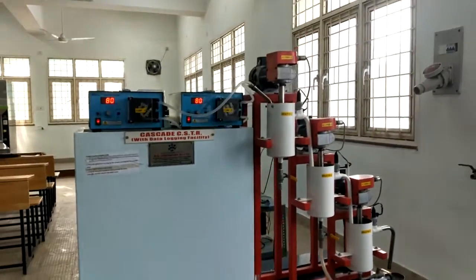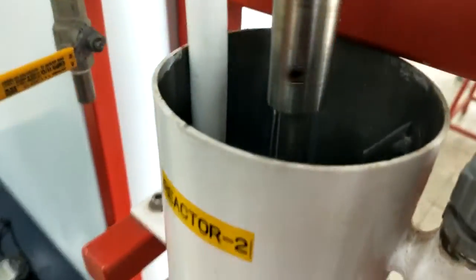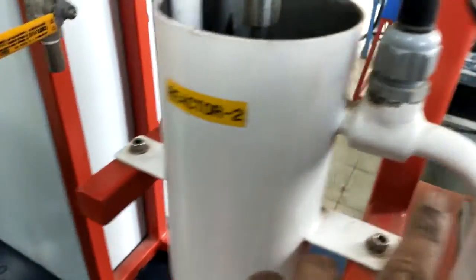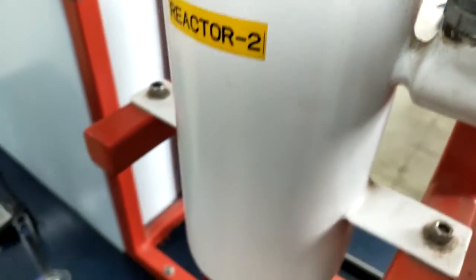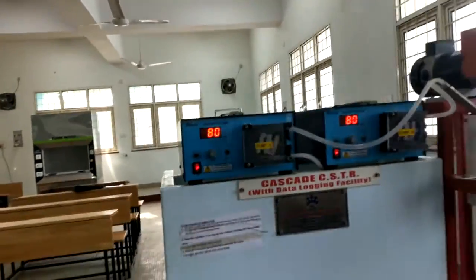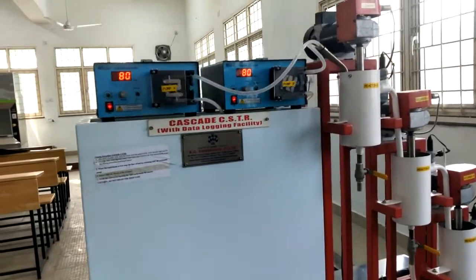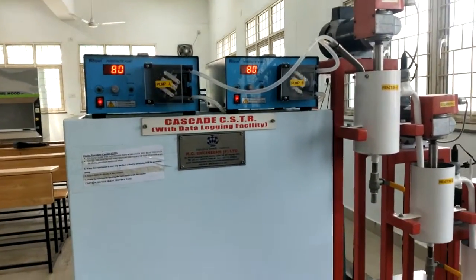Okay, we can see the first reactor has filled and the second reactor is half filled. So once it is filled up to this level, we are going to have feed to the third reactor. Okay, what is it? We are doing it for the third time at the third RPM, that is 80 RPM. We started with 60 RPM, 70 RPM, and now we are doing for 80 RPM.